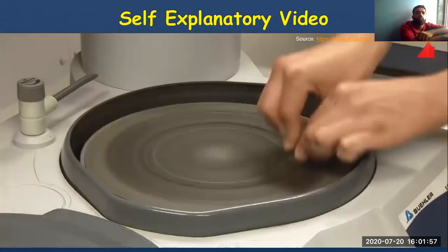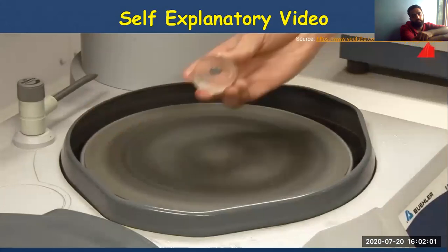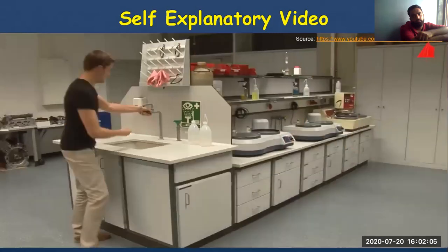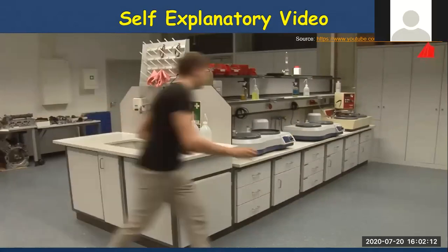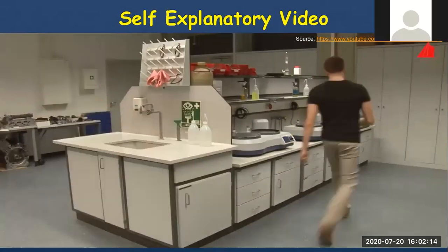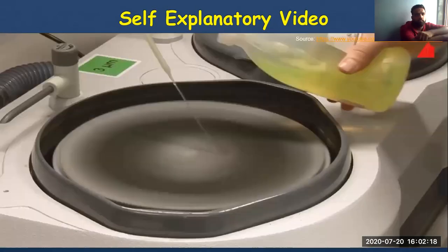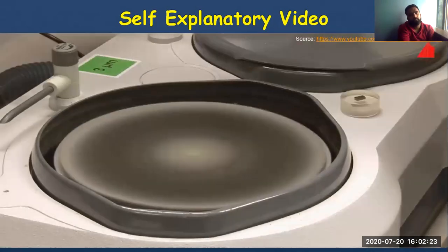But still there are many fine scratches to be found, resulting from the 6 micrometer diamond abrasive. To remove them, the material tester washes the specimen and his hands again very carefully and polishes the specimen for a second time. Now he uses a softer short nap polishing pad, finer diamond suspension of 3 micrometer particle size and less pressure.